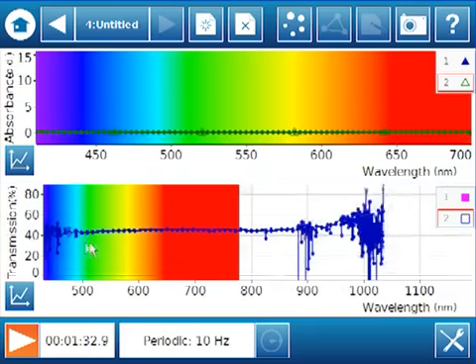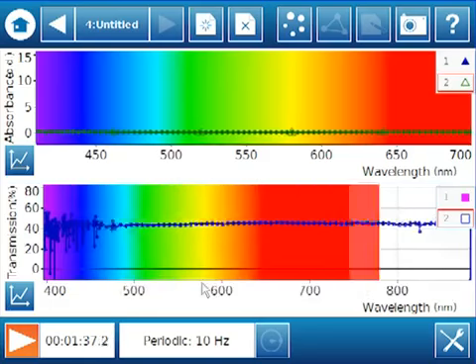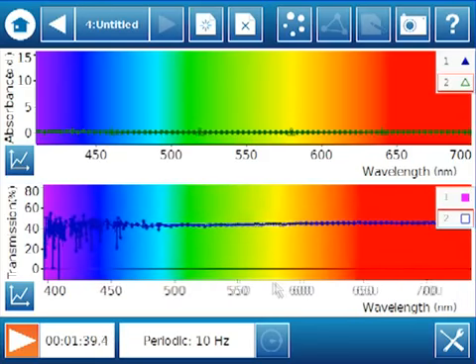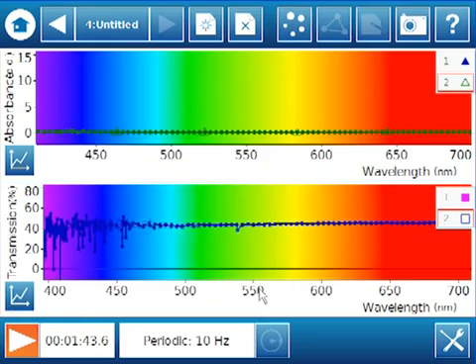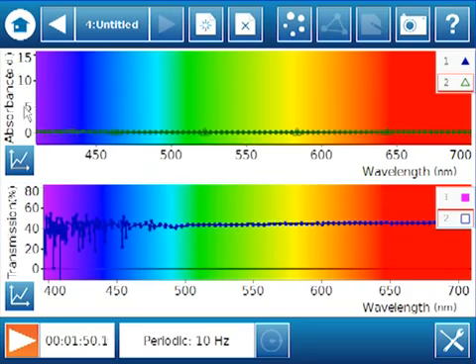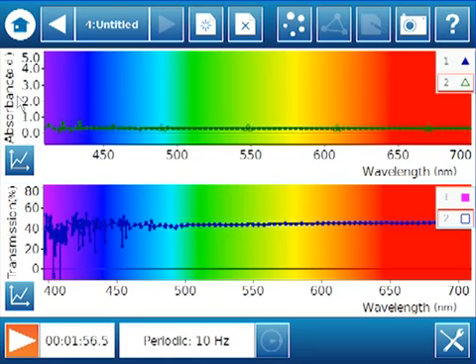And we will bring this over to the visible spectrum and stretch that out. And again, we have a little bit of noise going on in here, but we'll still be able to get the effect of the absorbance and transmission relationship. I'm going to scale this a little bit also, because normally you don't get absorbances greater than 3. So we'll go to 5 or so.